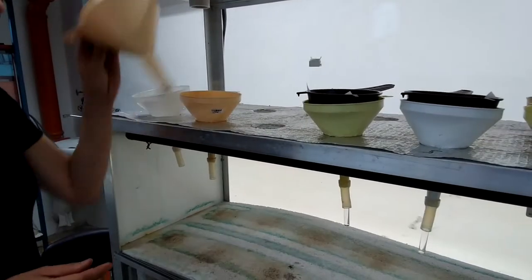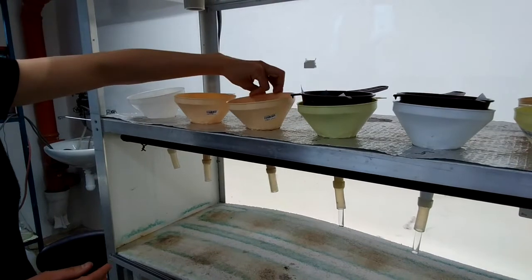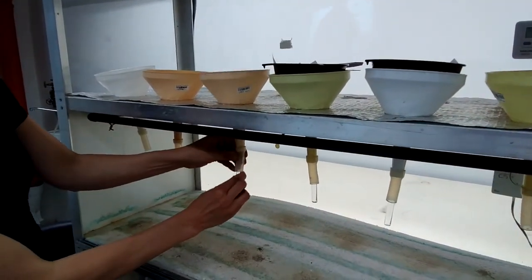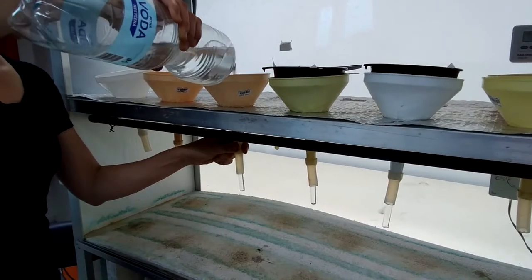To prepare the extractor, place the funnels in the funnel holders, attach the vials at the bottom of the hoses, and fill the funnels with drinking water by about a half.